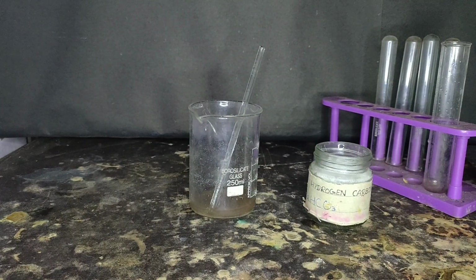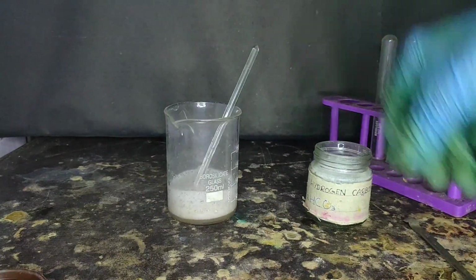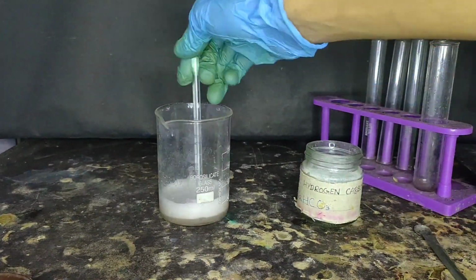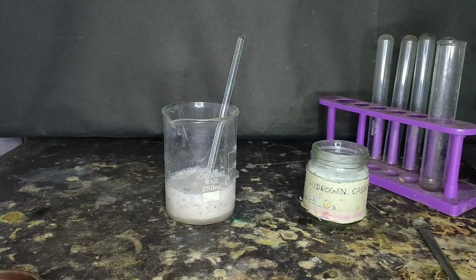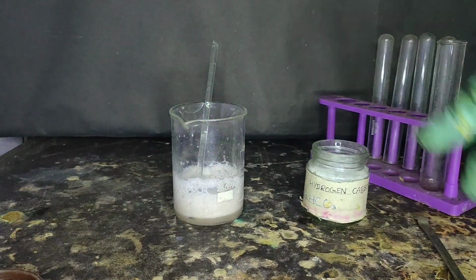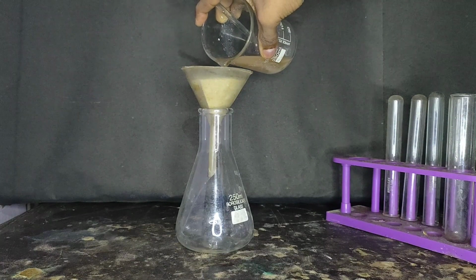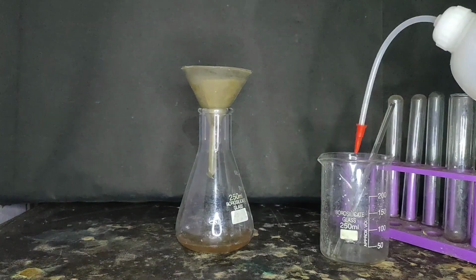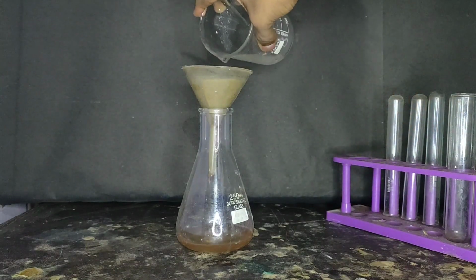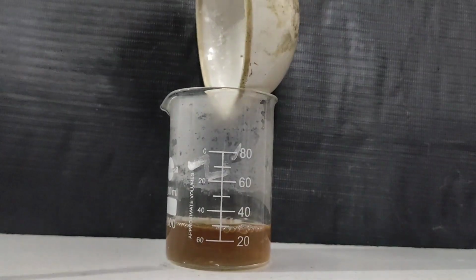To this solution, sodium bicarbonate is added in small portions until effervescence ceases. After all the acid is neutralized by the sodium bicarbonate, the solution of sodium naphthalene sulfonate is filtered, and the precipitate is washed with distilled water. This solution is then concentrated by heating and then transferred into a small beaker.